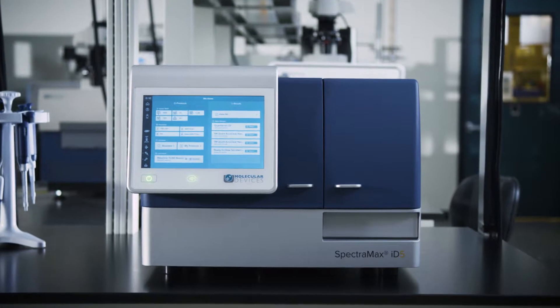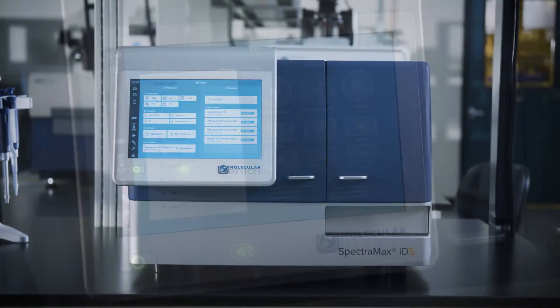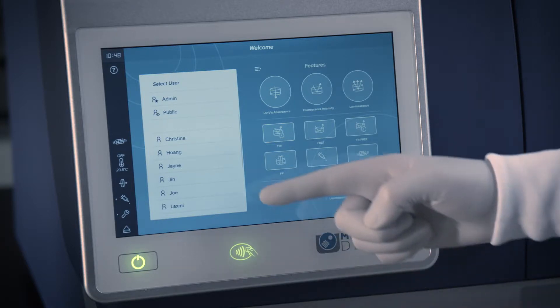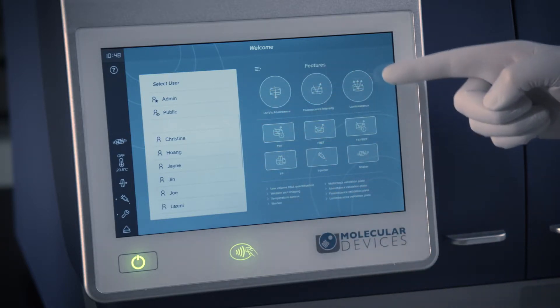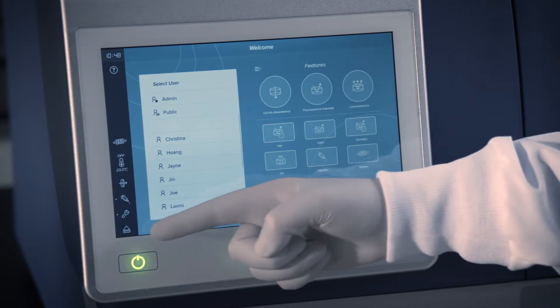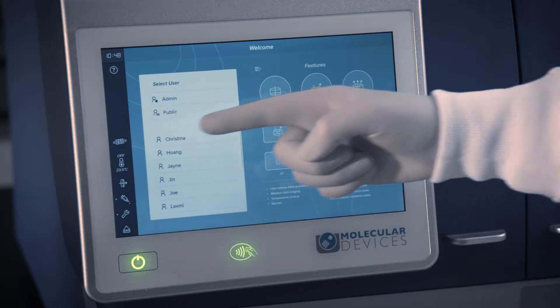Welcome to your new SpectraMax ID multi-mode microplate reader powered by Softmax Touch software. The easy-to-use touchscreen interface will help you get to your results faster. The welcome page offers you the option to log in to your personal home page, learn about the features your instrument is capable of performing, or access instrument settings.